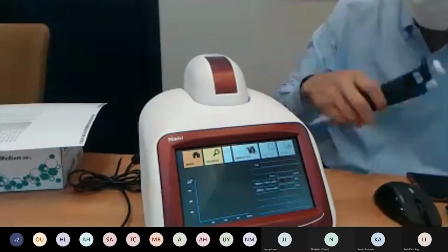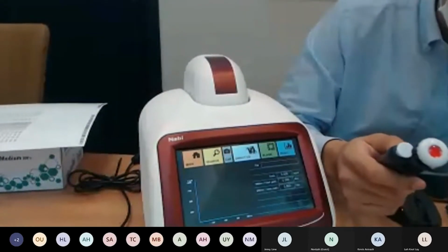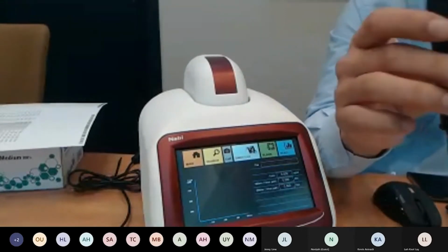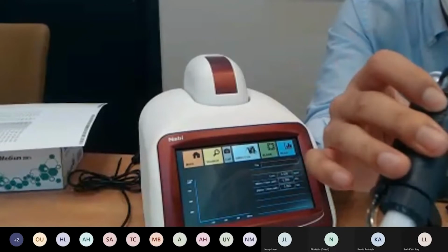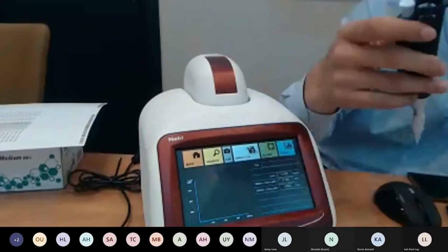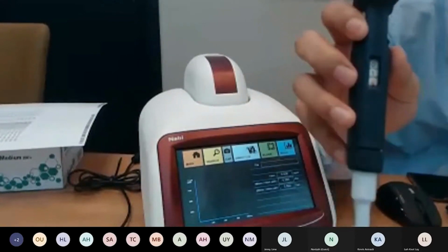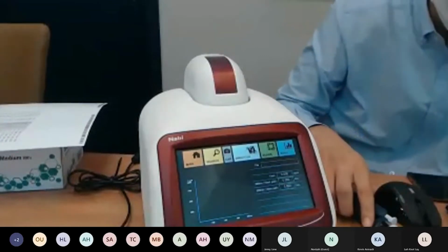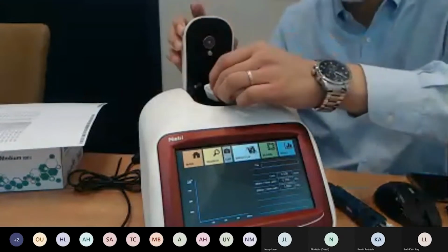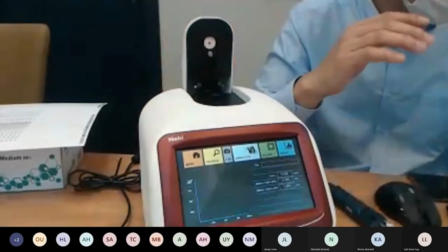Oh yes, I forgot to mention, but for micro volume, the sample size that you need is 1 microliter. So for example, all you need is a micropipette that can do between 1 and 10 microliters. But we do recommend using 1.2 to 1.3 microliters, because for 1 microliter, the results may slightly vary due to there not being enough sample to make the column properly.